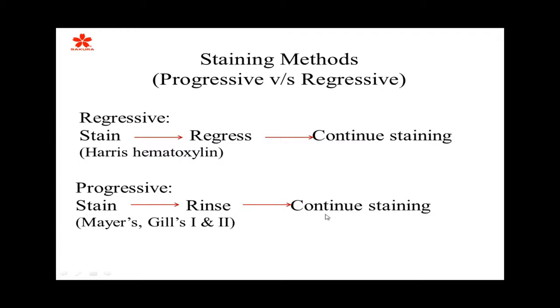Now, the staining systems come somewhere down here as a third, where you stain, you rinse, and then you use a mild acidic solution, not something strong like hydrochloric acid for differentiation, but a mild acidic solution, and it's not even considered differentiation. But you do that just to clean up the nonspecific or endogenous areas of hematoxylin, such as the goblet cells, the excess mucin, or any nuclear or hematoxylin staining that you see in the cytoplasm.